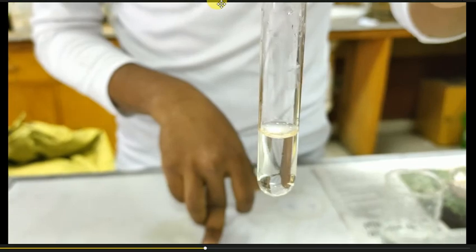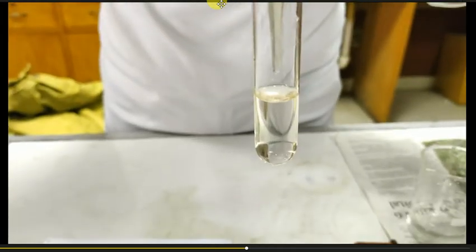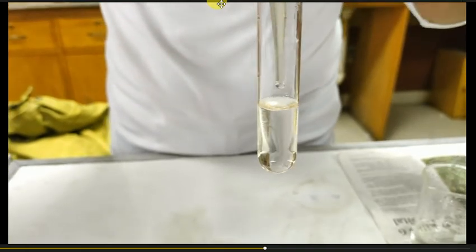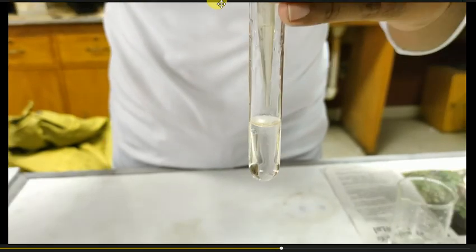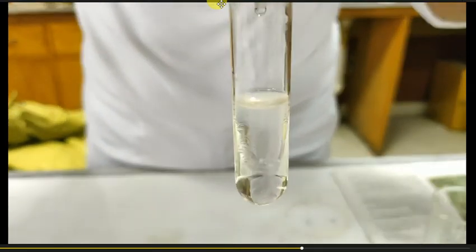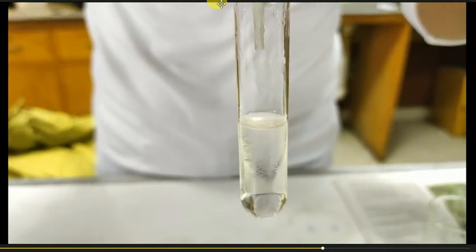Now in this solution we are going to add ammonium chloride, and we are going to heat this solution. Already the precipitate appears, and heating will make the appearance of the precipitate faster.